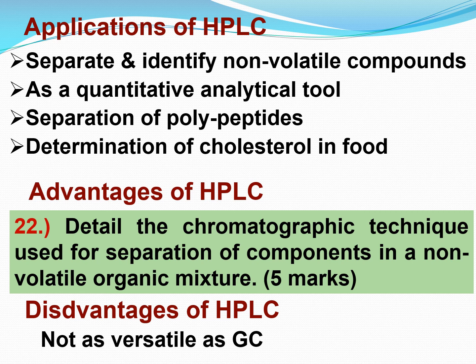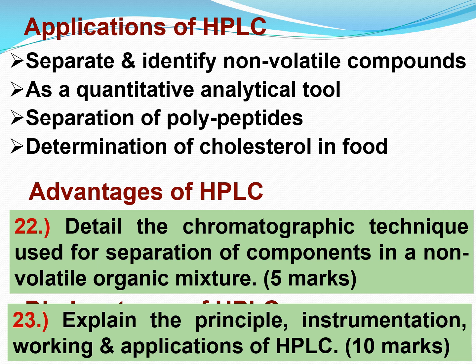One question: detail the chromatographic technique used for separation of components in a non-volatile organic mixture. Or explain the principle, instrumentation, working and applications of HPLC. So these are two important university questions.